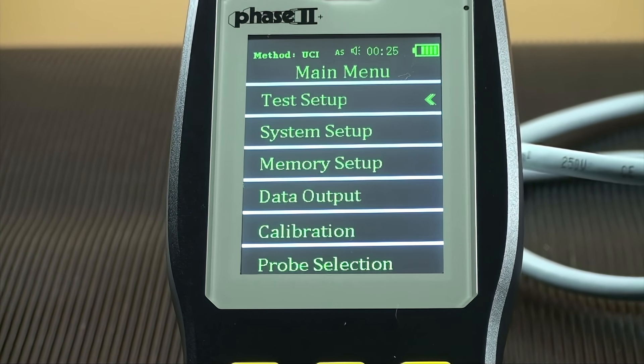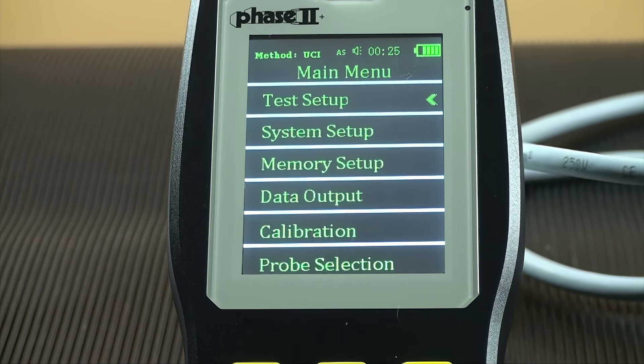The menu button on the keypad brings you to a selection of parameter settings: test setup, system setup, memory setup, data output, calibration, and probe selection. We highly recommend that you contact technical support to handle any calibration issues or to add calibrations of new material scale combinations.